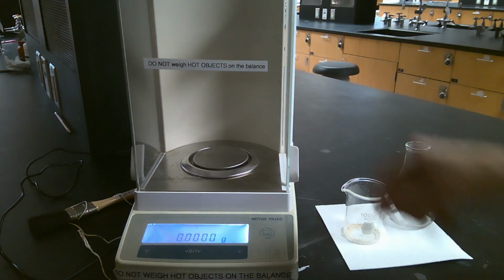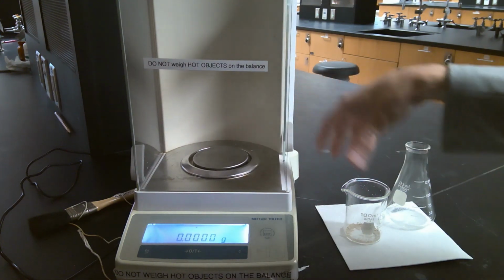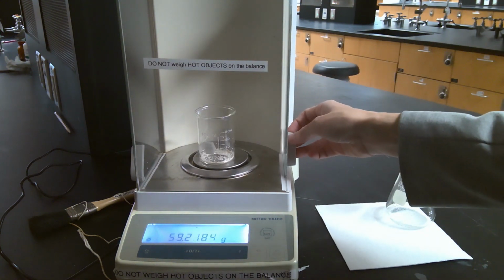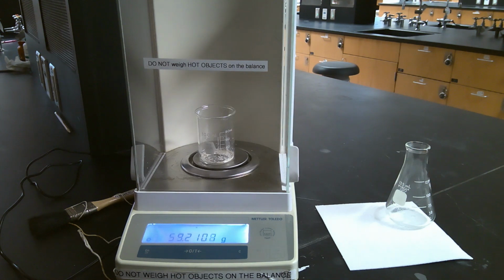Tare it again. Next will be the zinc iodide product in the beaker. Alrighty, and then you'll record that value.